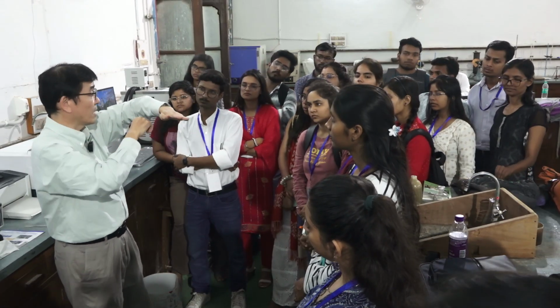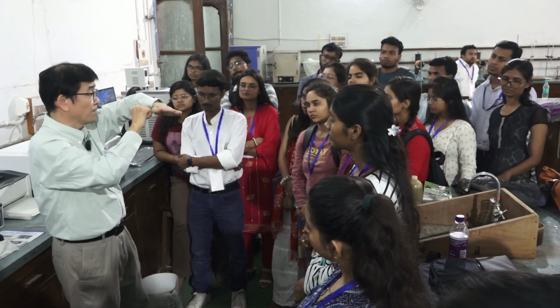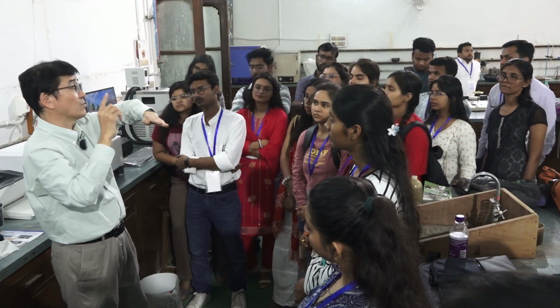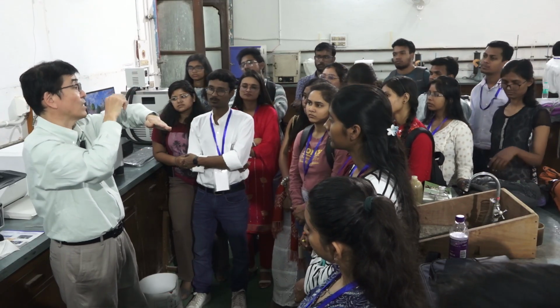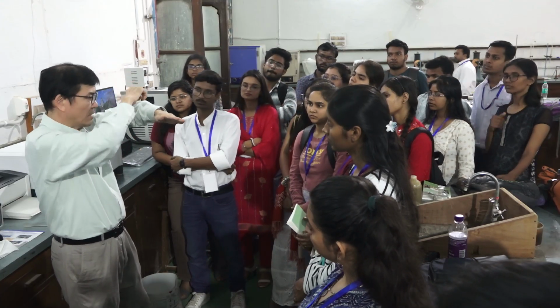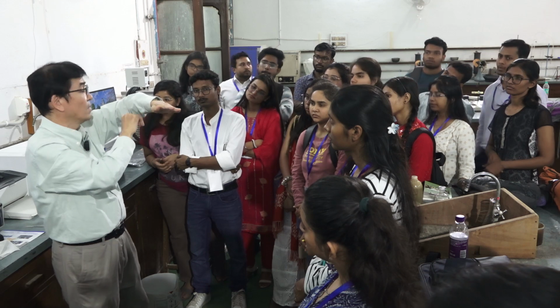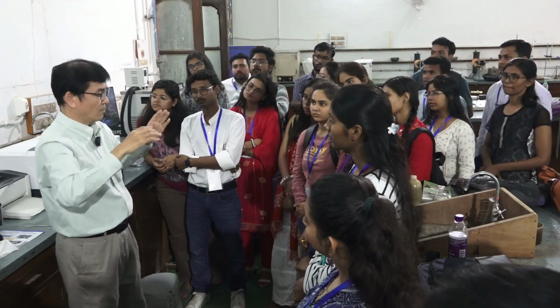But in ATR, the penetration depth of the evanescent wave depends on the wavelength. 4,000 wave number corresponds to 2.5 micrometer wavelength. 400 wave number corresponds to 25 micrometer. So the 4,000 wave number IR beam penetrates a short distance, and the 400 wave number light penetrates a long distance. So the path length is different for each wavelength.